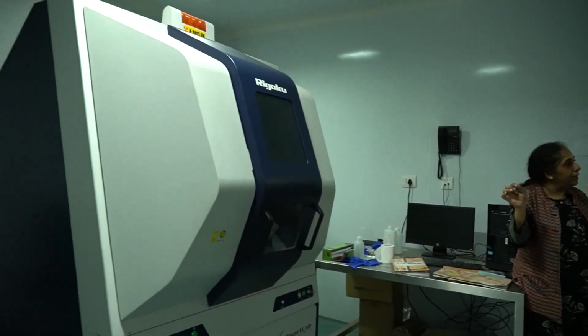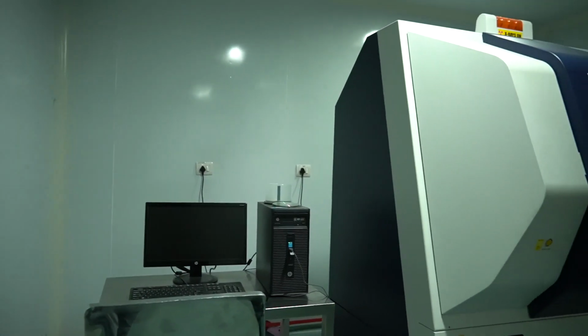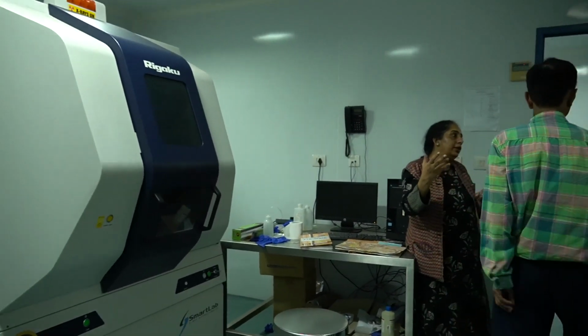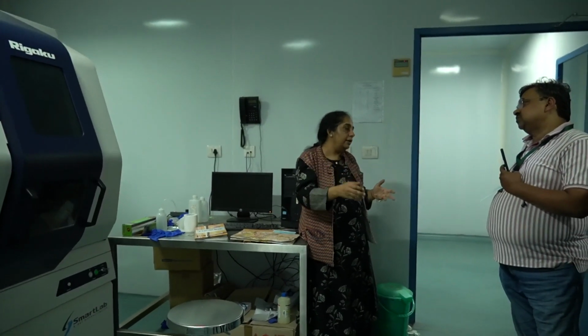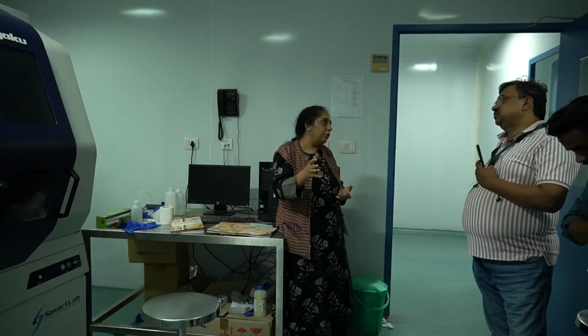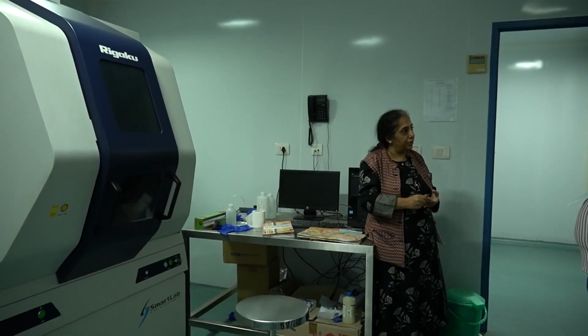We assign these planes to the XRD peaks, and on the basis of 3 factors, intensity, FWHM and position, we are able to assign the JCPDS file and accordingly name the phase, like titanium oxide has different phases. So with this we can do that.